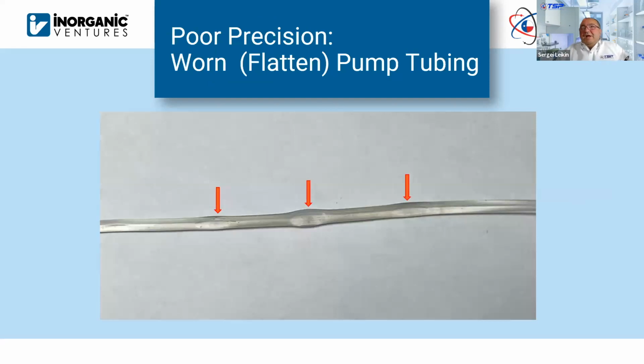So this is what I did myself. I just forgot to release the tension on the pump overnight, and came in the morning and tried to fire it up, and then saw that the tubing is flattened. So this definitely should be replaced immediately.